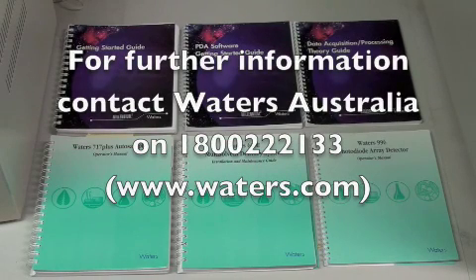If at any stage you require further assistance or troubleshooting guides, you can refer to one of these manuals.